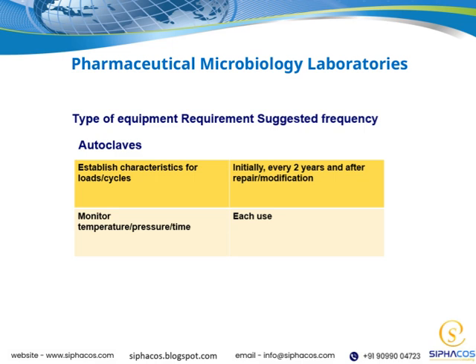They also implement rigorous sterilization and contamination control procedures to prevent any cross-contamination. Overall, pharmaceutical microbiology labs are a cornerstone of quality assurance in the industry. They help us verify that our products meet safety standards before reaching patients, which ties directly into our overarching goal of ensuring drug efficacy and safety.